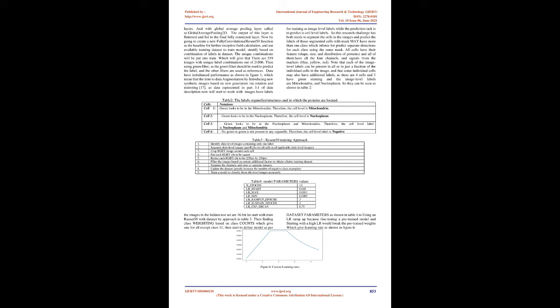The usual classification implementations do not always provide models that are easy to reuse. Deep neural networks have proved their value in extracting information from large-scale image data 22. It would be unreasonable to believe that the same will not be true for high-throughput microscopy. Adaptation of the technology will depend on the ease with which it is deployed and shared between researchers. To this end, we have made our trained network freely available.